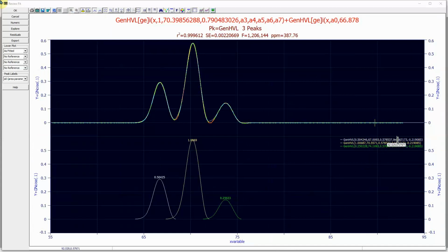The difficulty will rest with the fact that the other parameters will also change. The higher moment parameters will be shifted as a consequence of the IRF being larger than it should have been. And also when you deconvolve, it's something as simple as the widths themselves are going to be significantly reduced in size. We generated widths close to 0.8. We have actual fitted widths below 0.6 as a consequence of the sharpening that occurred in the deconvolution.